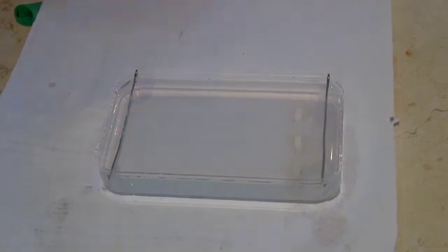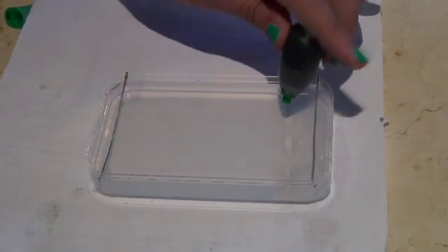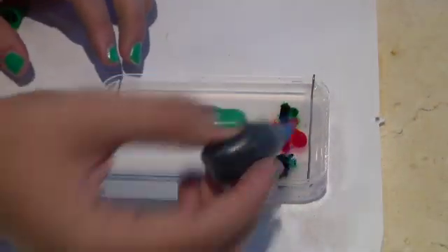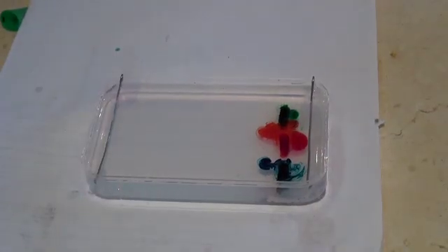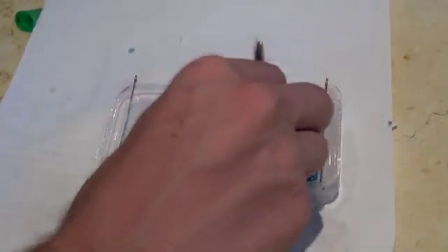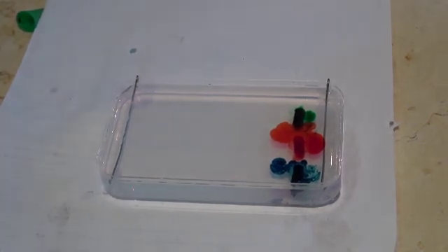Carefully add a few drops of food coloring to each well, making sure to place the nozzle below the surface of the buffer solution. First we'll add some green, then red, then blue food dye. Don't worry if the food dye starts to mix in the buffer solution. So long as the drops go into the wells, everything should work just fine.